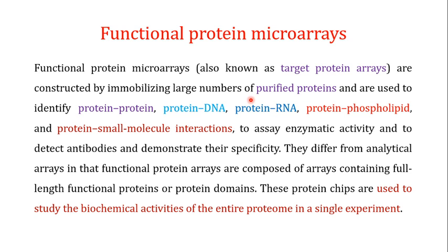But in the functional microarray, you are actually focusing on the interaction of the purified proteins with the protein, DNA, RNA, the phospholipid, or any other small molecules. The functional protein microarray is also used to assay the enzymatic activity or to detect antibodies and demonstrate their specificity.